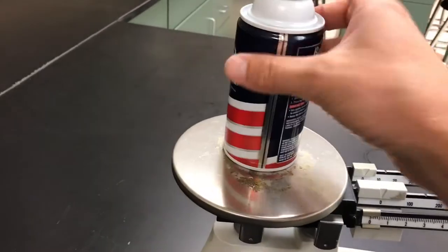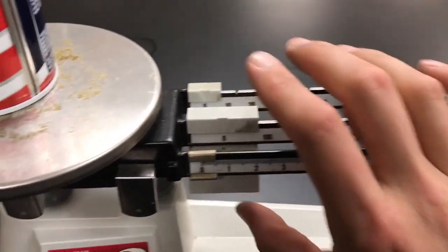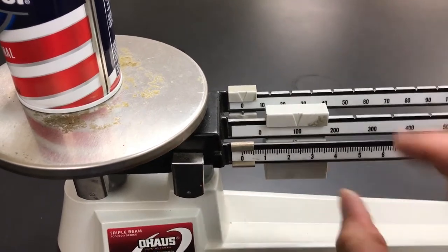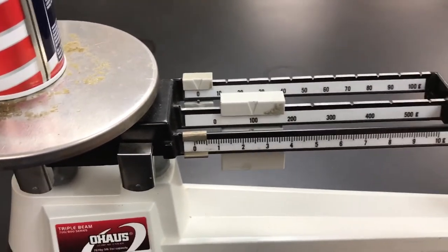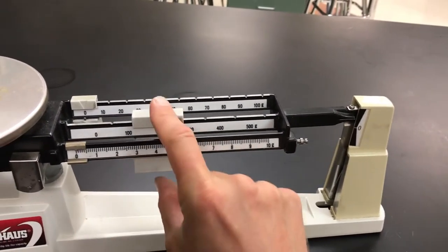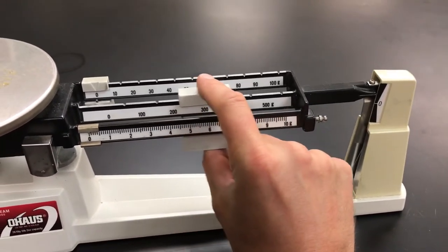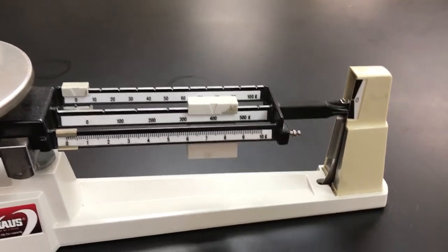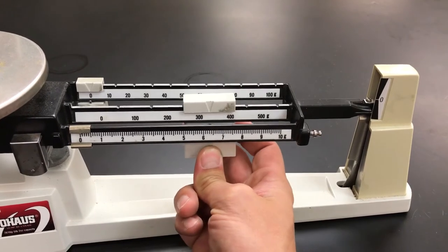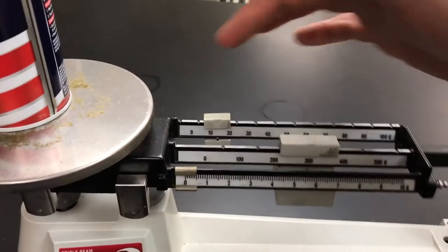The first thing you need to start with is your hundred-gram rider. Slide it over and make sure it clicks into place. I slid it to 100 — nothing happened. Slid to 200 — still nothing. 300 — moving a little bit. 400 — it dropped down. So 400 grams is too much; I know the mass is less than 400 grams. So I slide it back to 300, then move to my tens beam.